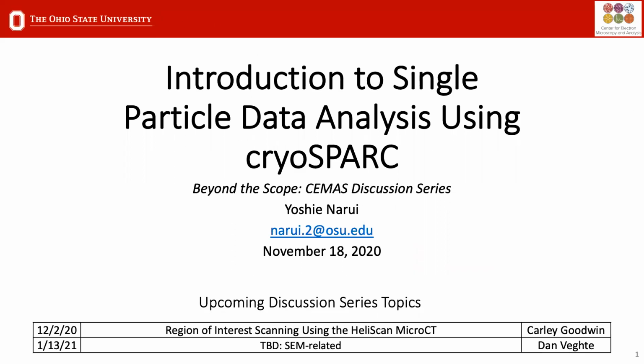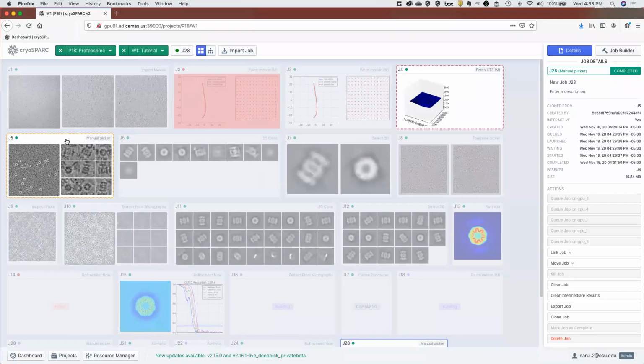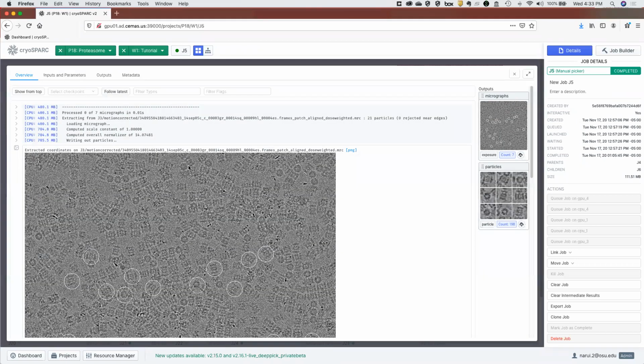And then when you're all finished, you would just say, I'm done picking, extract the particles. So it's just extracting the location of those particles. Okay. So I hit done and then it basically spits out the results. Okay. So it says it's completed. Okay, so I have done that here already in this manual picking job. And I think what came out here, you can see on the right, I picked 198 particles. Okay, so those are the particles I picked from that previous job.